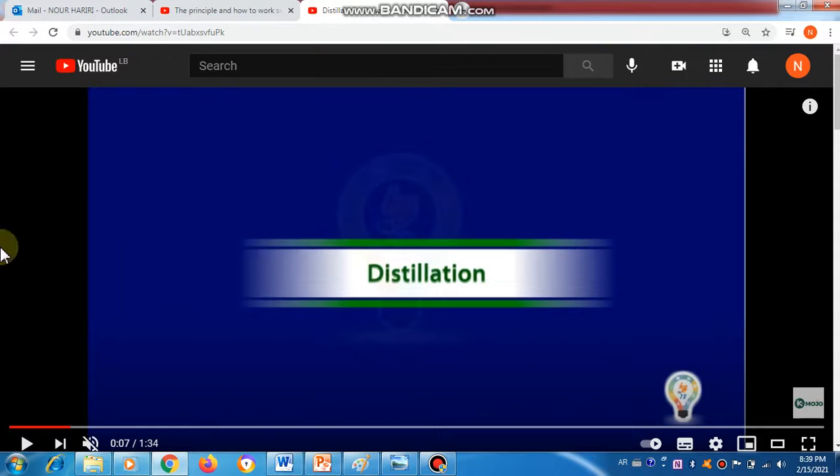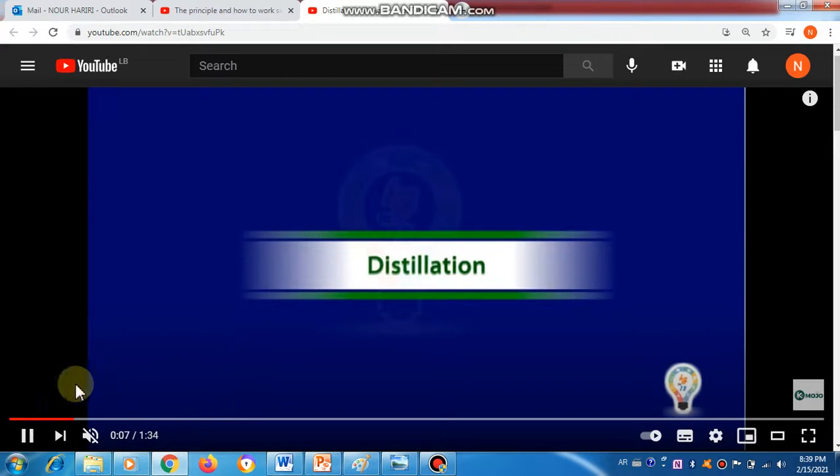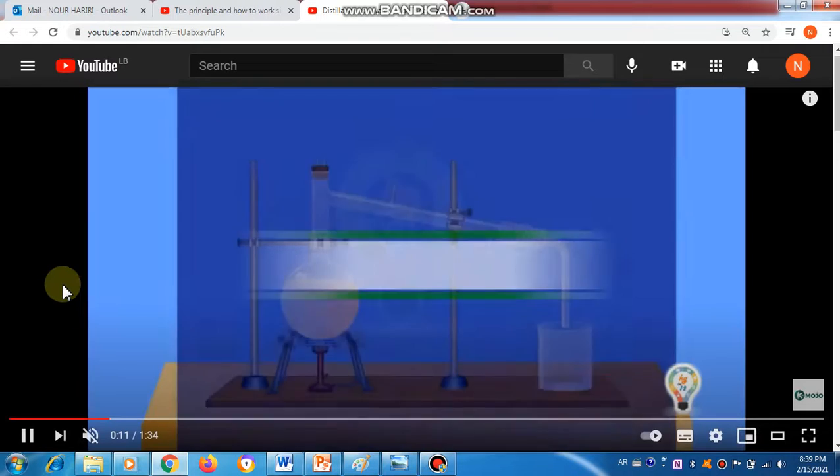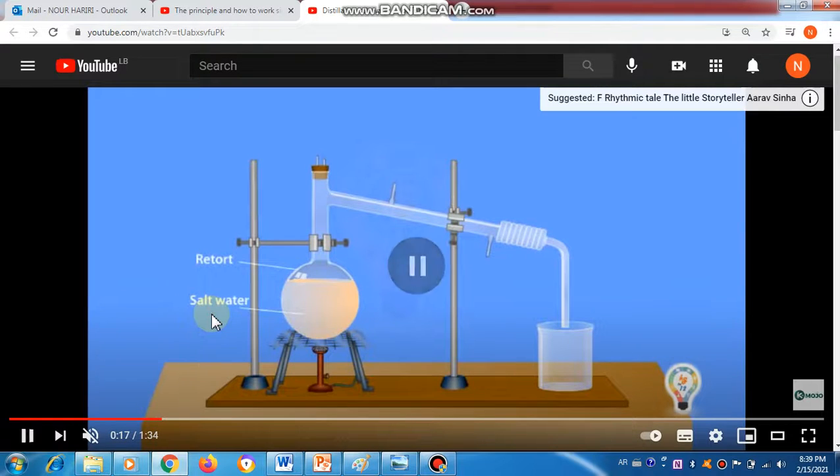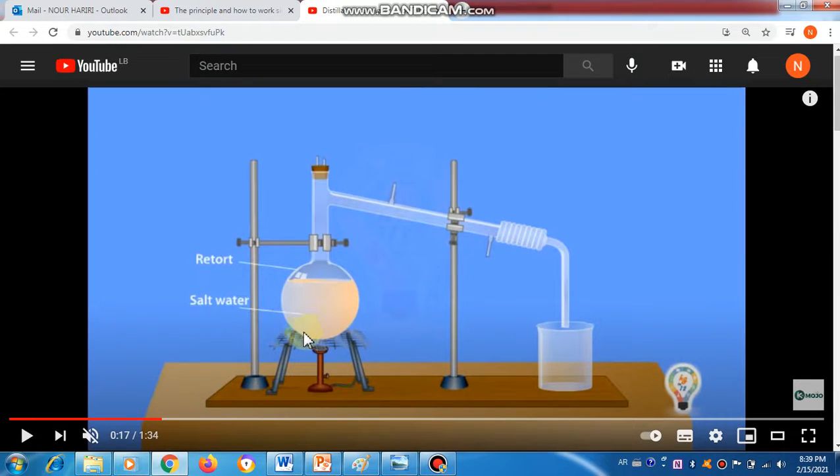بهيدا الفيديو رح نشوف two experiments. أول experiment هي simple distillation used to separate a homogeneous mixture of solid and liquid. رح ننقي salt water. Salt dissolves in water so it makes a homogeneous mixture يعني of one phase. ما شايفين two phases, one phase.